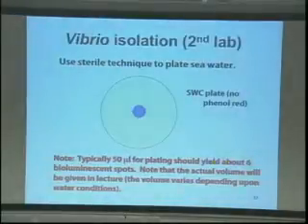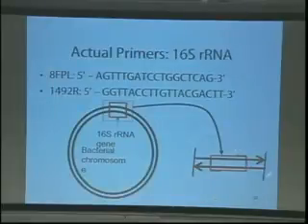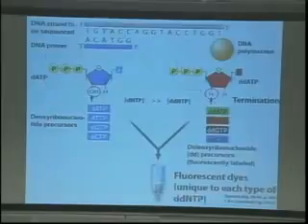So let's just take, and this is the isolation seawater plate, streak, nice isolated colony, pick one of those. PCR, we'll talk a lot more about this. I mean a lot, okay? We'll do this PCR reaction, we'll end up with lots of that DNA. We'll run it out in a gel, the gel will separate the bands, we'll quantitate it and send it out for sequencing.